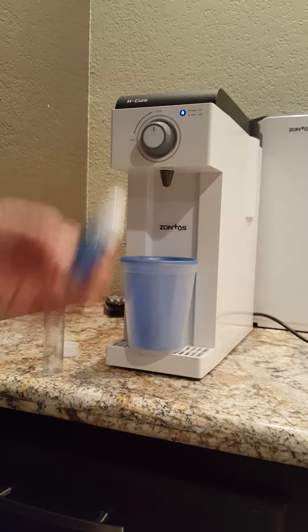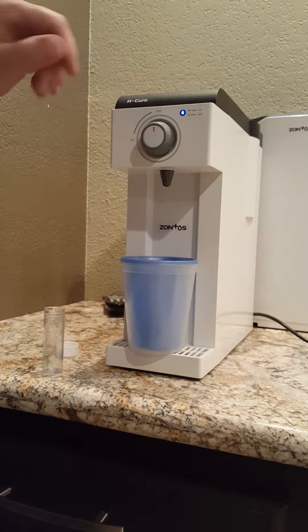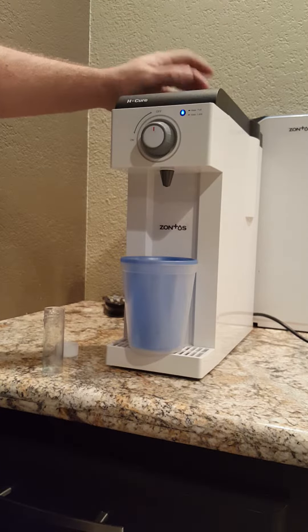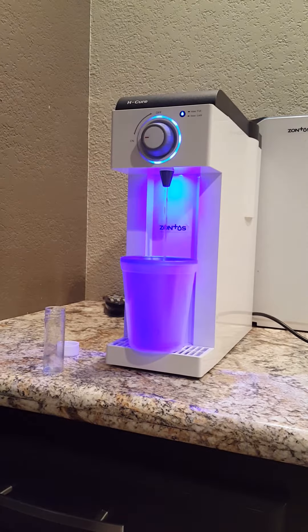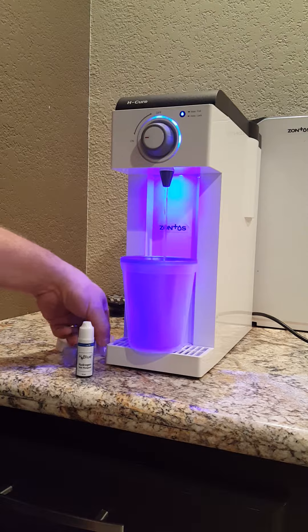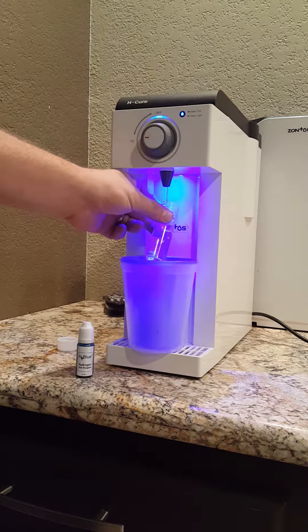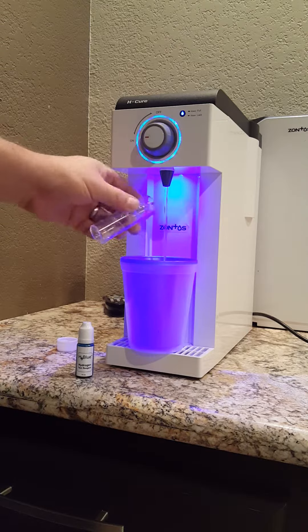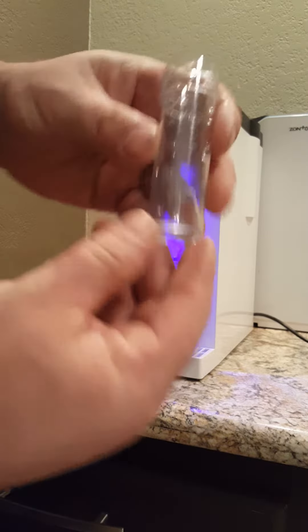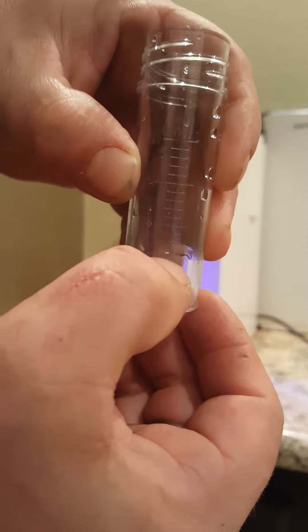So we're going to test this unit that claims to have 1.2 to 1.6 parts per million, and we're going to do it all live right here. So just to let you guys know, there is the 5 and this is 6.